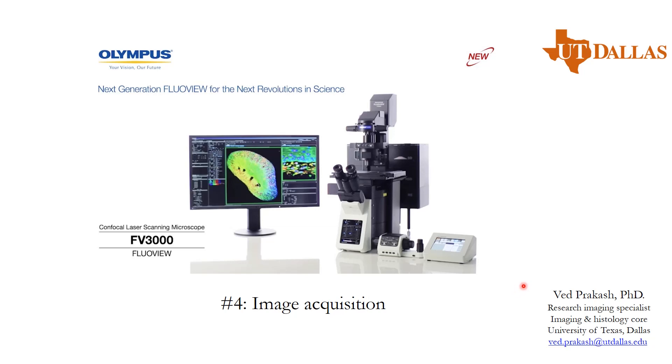Hello, welcome to module number 4 of Olympus FV 3000 Flowview software demonstration. In this module we will be discussing how to acquire the image and set the parameters like Z series and time series.